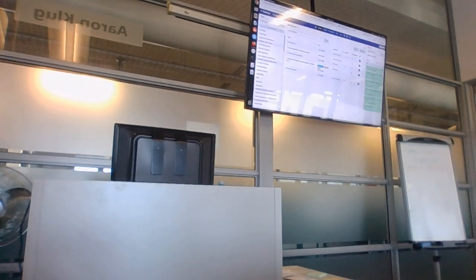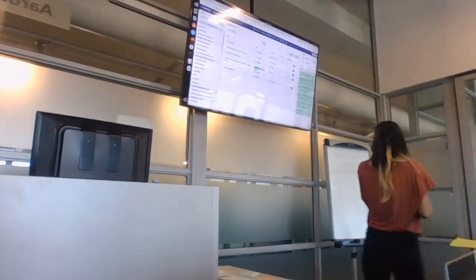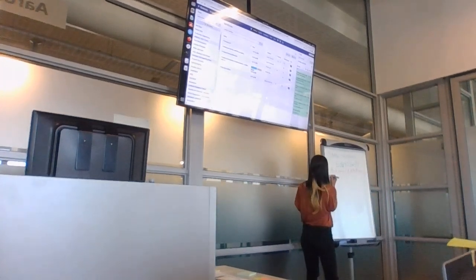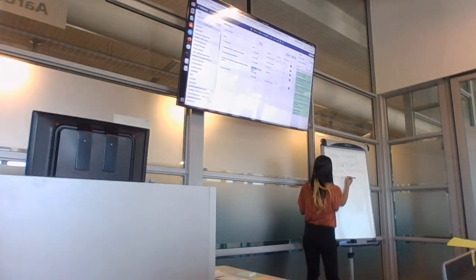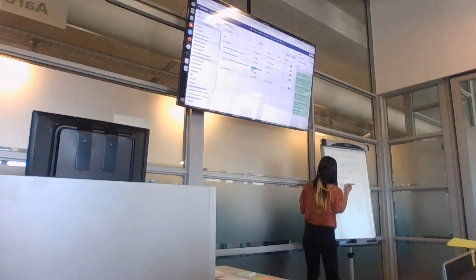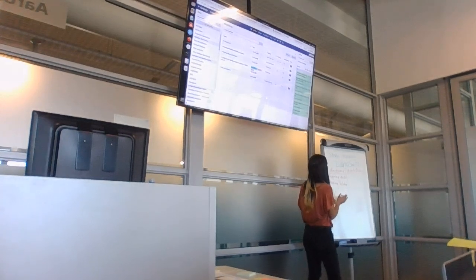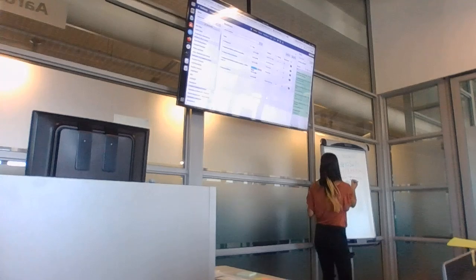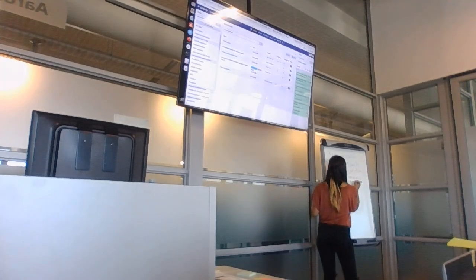Introduction, we did two things, but they're actually connected. Collections, you can see as, I suppose another word for it is grouping data. You can see it as making a folder with your data. Workflows is basically an analysis, right? But it's multiple analysis, so it's probably better to call it a pipeline.